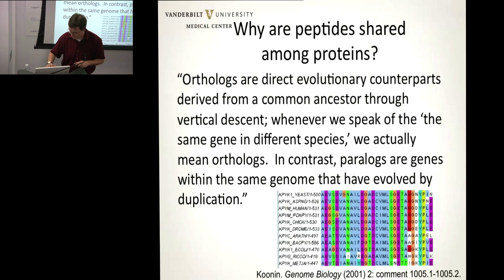So let's talk about building proteins from these. I mentioned that we were going to have to circle back around to this in a while. We had started by chopping all of our proteins up into peptides, which of course threw away information about which peptides were linked to which. That's a big problem if you're trying to do some very insightful isoform studies or look at long stretches of proteins.